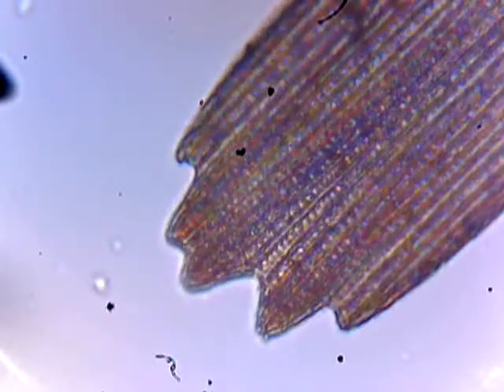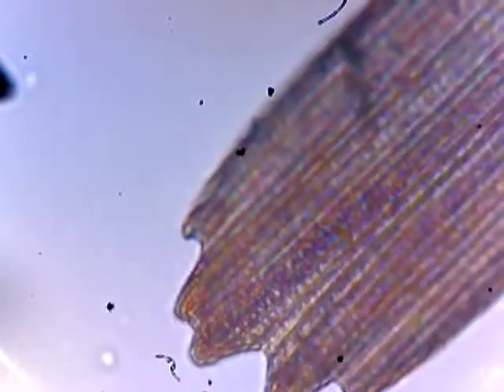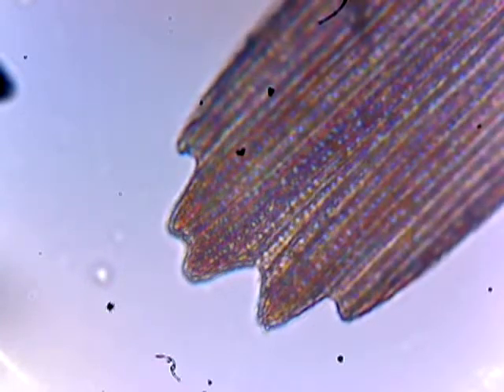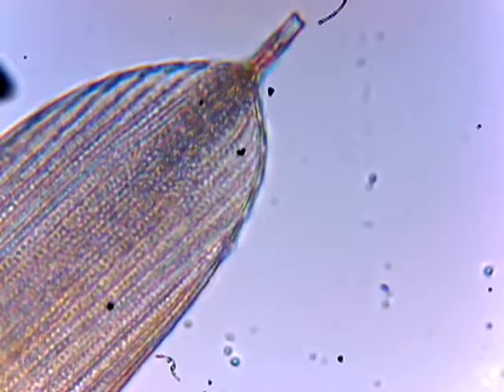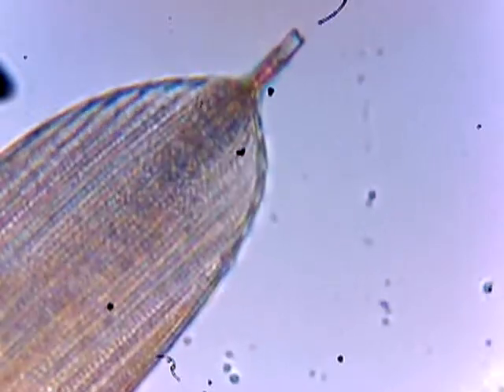That dust on the moth's wing that gets on your fingers when you touch it, or a butterfly's wing — you would have to speculate on what exactly it is. You would have no basis of knowing anything about what it really is and what it does. You'd just have to assume it's fairy dust or something. Fascinating, really.